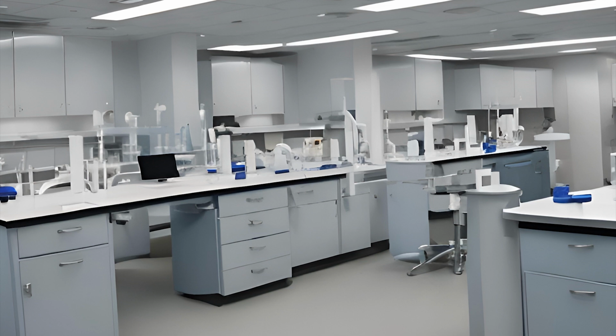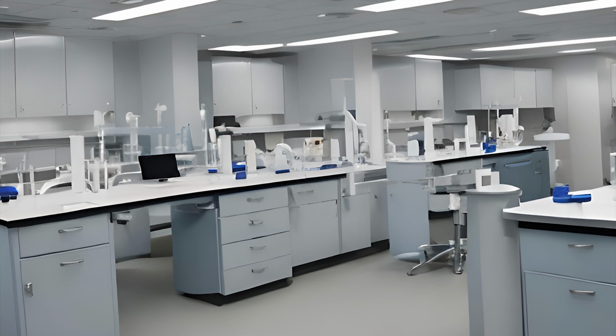You also have to keep in mind time limits. All specimens should be transported to the lab without delay. You may have to repeatedly remind the other teams in the hospital that you work with of the importance of this requirement, because it is very inconvenient for a person to have to stop what they're doing and walk 5 to 15 minutes across the hospital to drop the sample off at the lab and then walk another 5 to 15 minutes back to where they were and continue their work. It adds 30 minutes of travel time, potentially, onto the process of getting that work done every time they have to bring a sample to the lab.